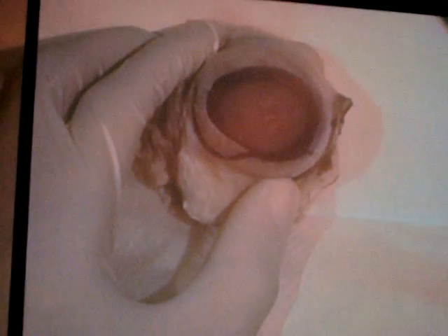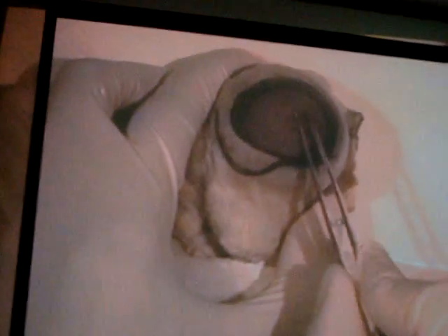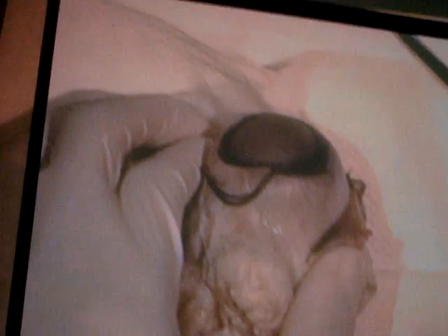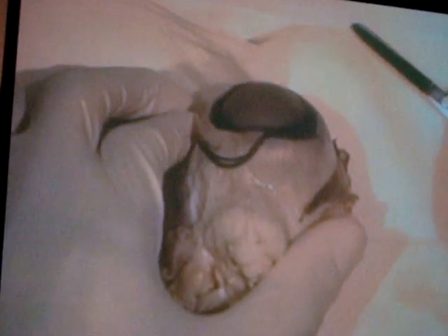If you ever hear of a person having an astigmatism, an astigmatism is an irregular curvature of the cornea. In other words, instead of this part being a smooth, even, well-rounded curve, if there were a dip or an irregularity — possibly a lump on that part — that's termed an astigmatism.